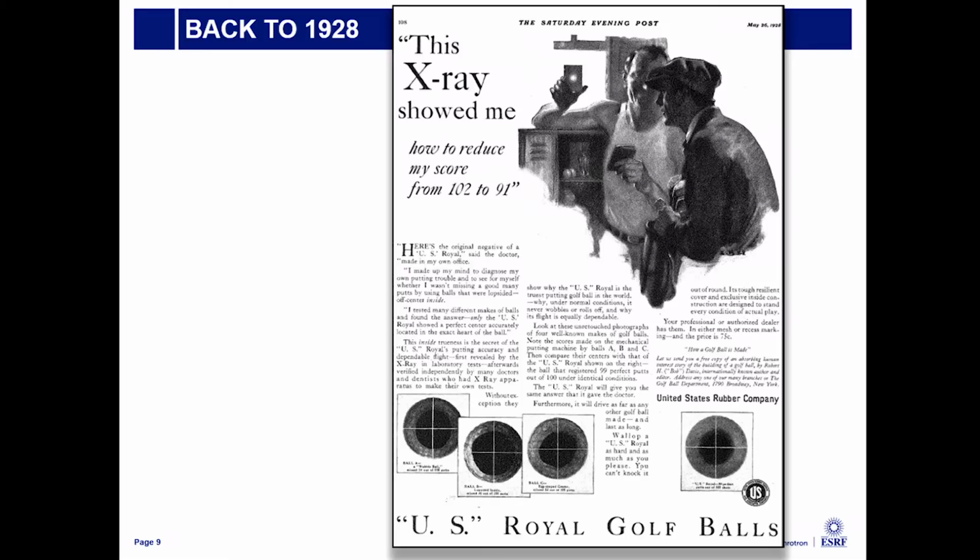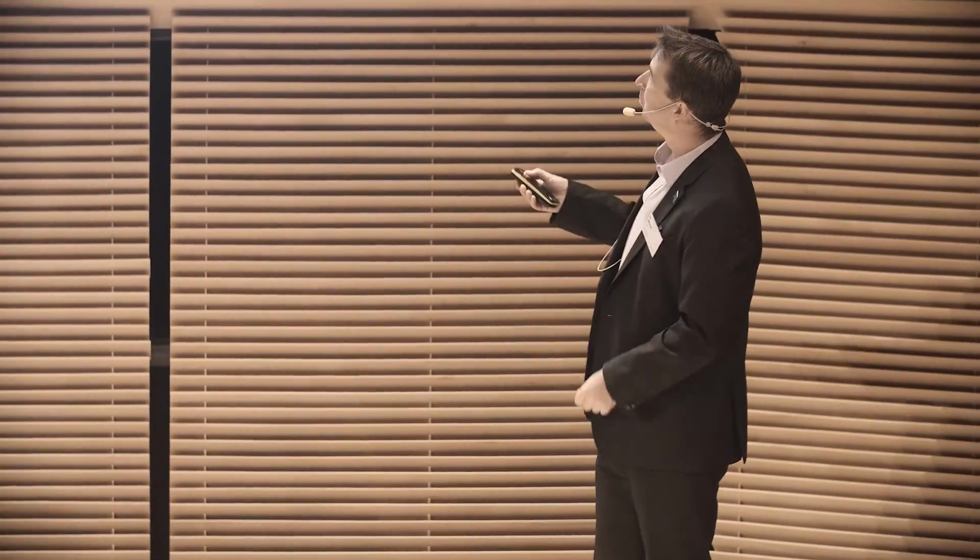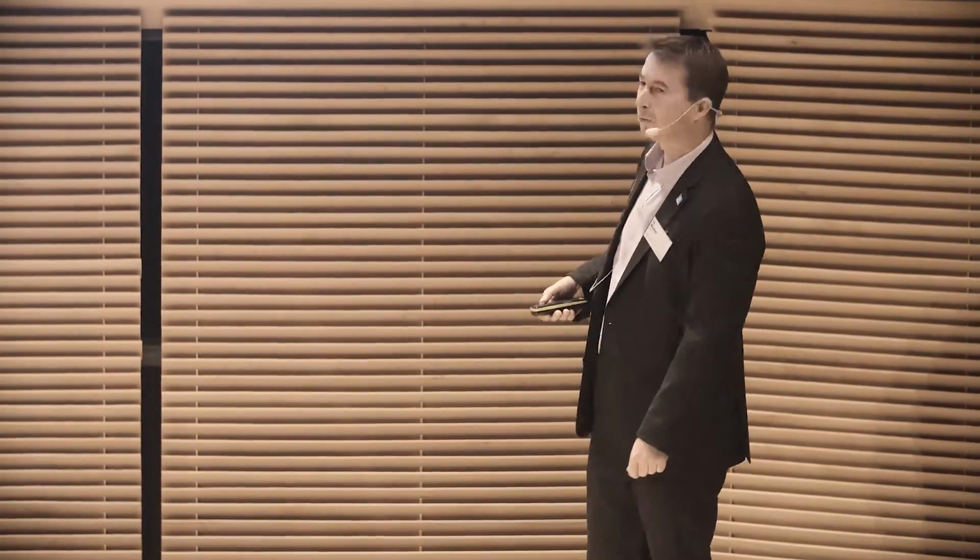You need some X-ray quality control. Just send us some of your balls, and we'll check them. So these guys were doing radiography. These are the competitors here, where you can see it's a kind of wonky egg shape. It's no good. And they were doing quality control. They could just look through the golf ball and show that the golf balls they were making had nice spherical interiors, and they were going to improve your golf score from 102 to 91, so saving 10. It's okay? Okay.